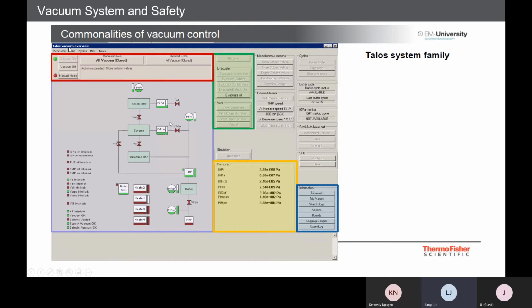If you see everything in green status, that means they are running perfectly. If you see dark red status, that means they're closed. But if you see a fresh red color, that means some error popped up. So you can read that status and see what kind of error you have. If you don't see a red error pop up, that means we're good.